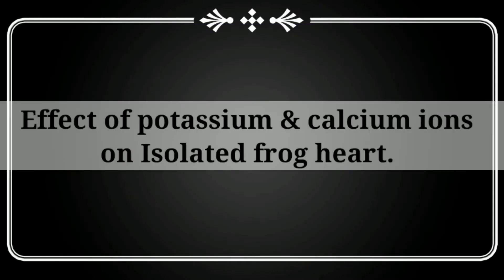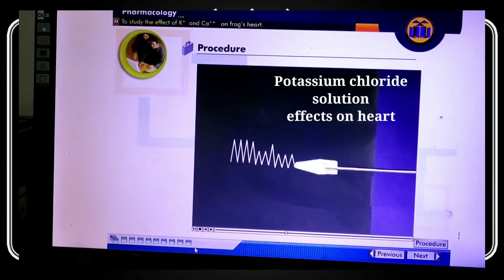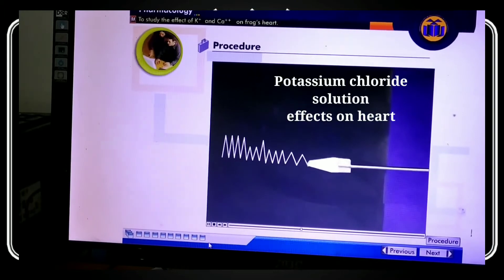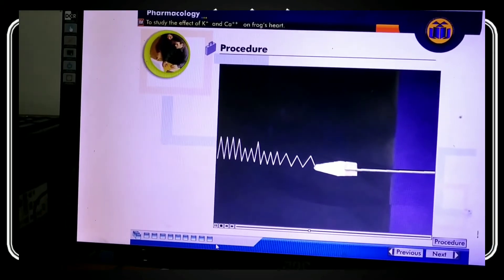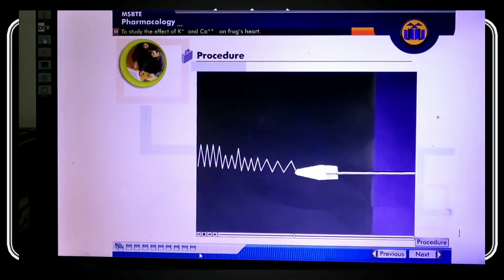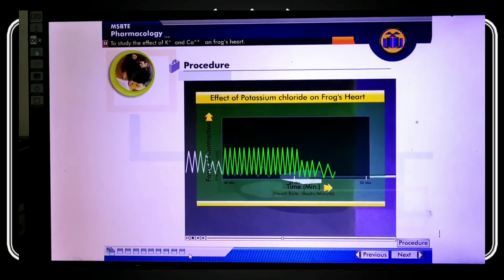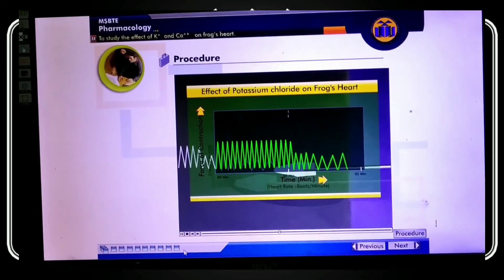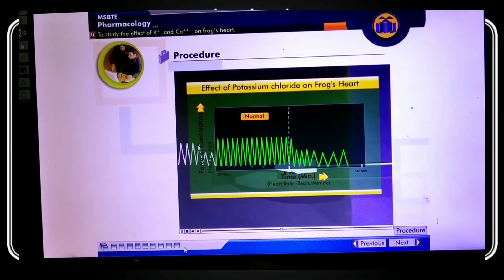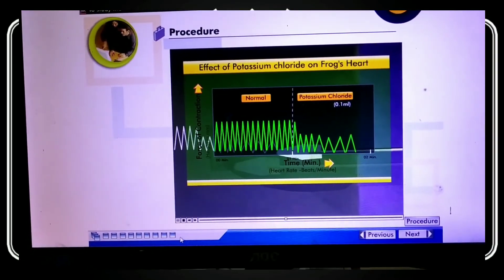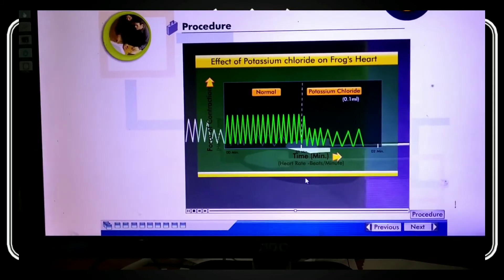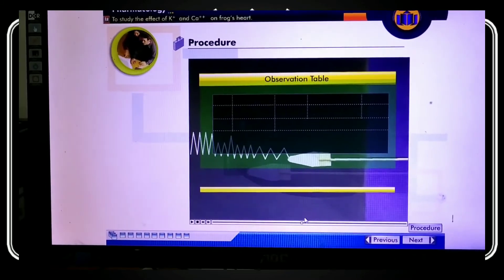After observing the normal graph, we will study the effect of potassium and calcium ions on the isolated frog heart. Potassium ions act on the heart muscle during diastole — the relaxation phase. During this relaxation time, potassium stops the heart because it is unable to contract. You can see potassium chloride 0.1 concentration blocks the heart at diastole.